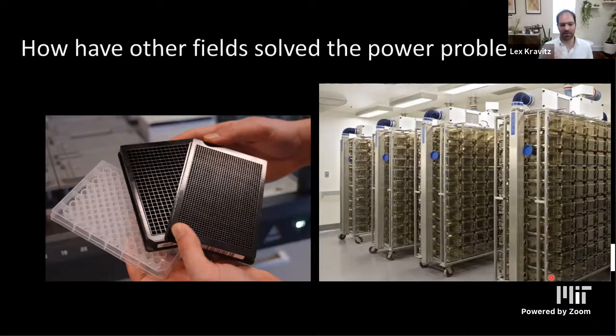There's been a lot of interest in this in the last, say, 5 or 10 years, with people making progress on home cage devices and approaches for studying mice, and showing many advantages, such as the throughput advantage that I'm mentioning here, but also that the animals are less stressed.